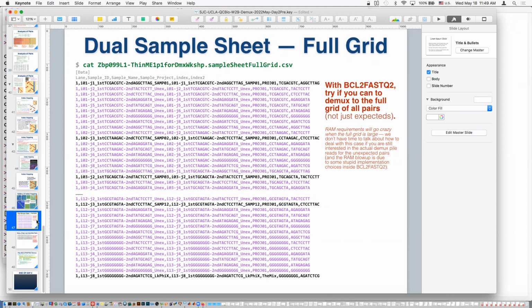I do recommend having the index merge, like we talked about, somewhere in the early part of the name. It may also be convenient to actually just have the numbers, because these sequences are hard for humans to read. So this is the 13th I1 target with the 7th I2 target. It's kind of easy to throw in at the front, and it helps you visually compare. I can see that these are all 12 much faster than I can see the sequence and know what that is.